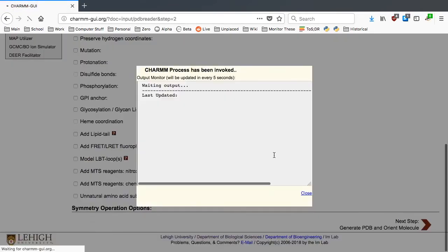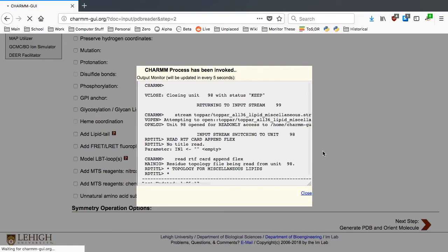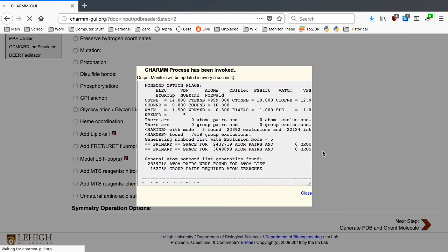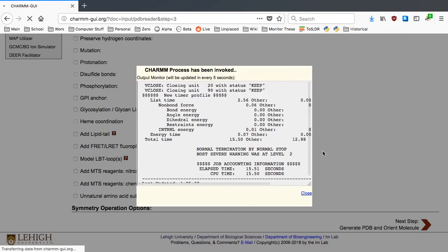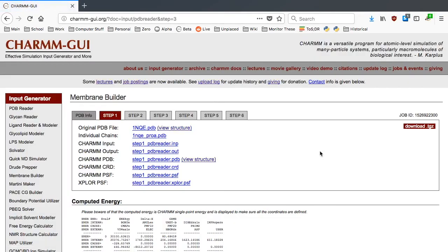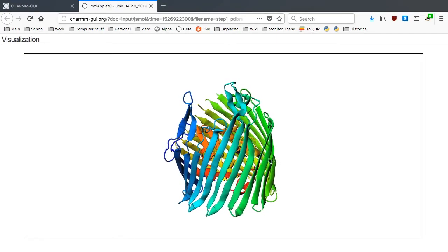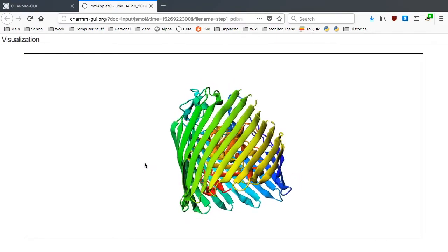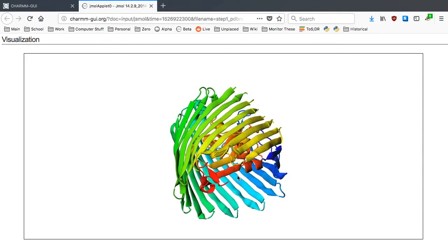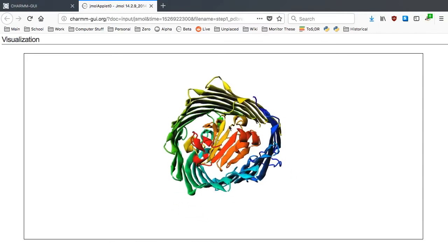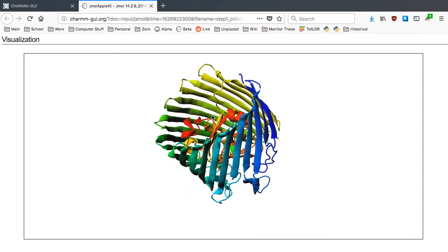Because we downloaded a pre-oriented BTUB structure from the OPM database, we don't need to change the protein orientation. BTUB is a beta-barrel protein, so it has a pore inside of it, and this pore is supposed to be filled with water molecules.